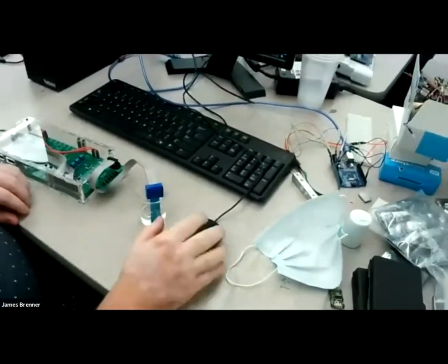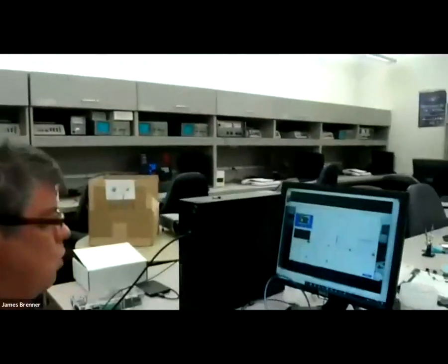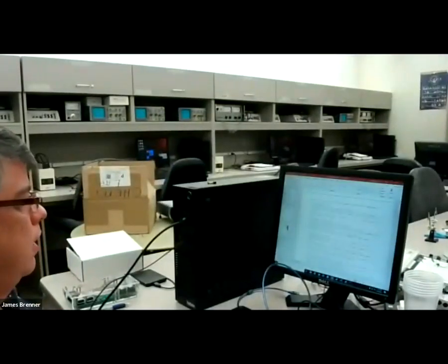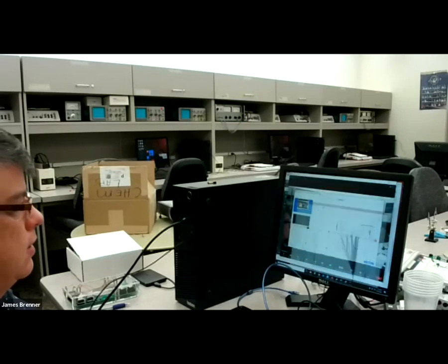Ultimately, I want you to go around the room, and you're going to record current versus voltage for all of the concentrations that are listed on here. Whoops, you're not seeing that.